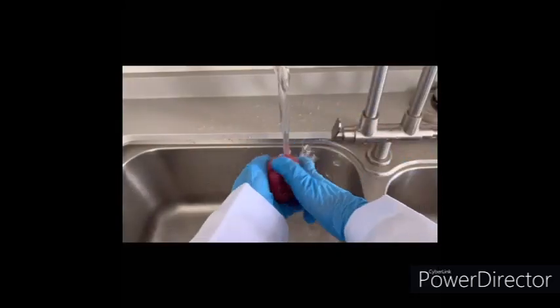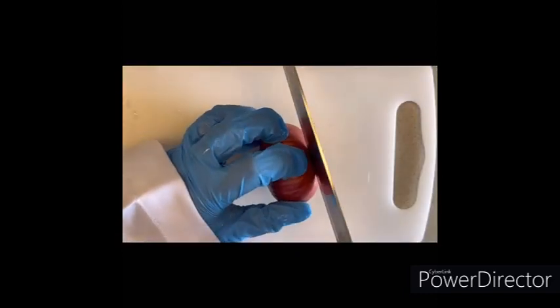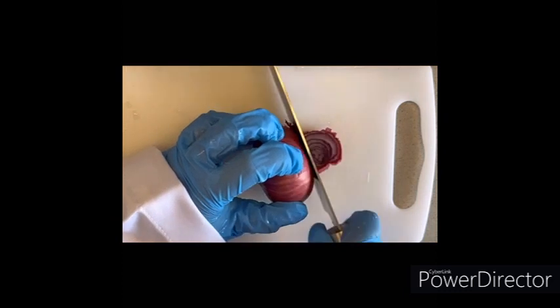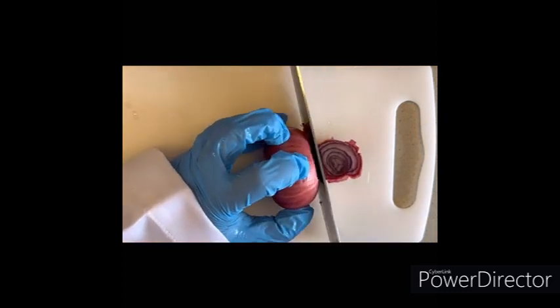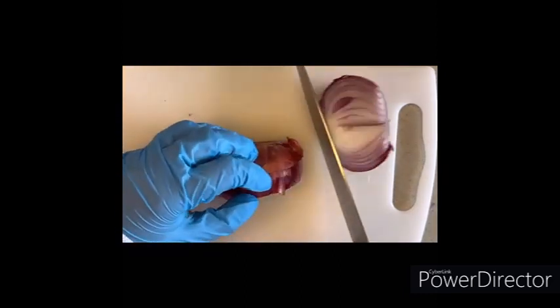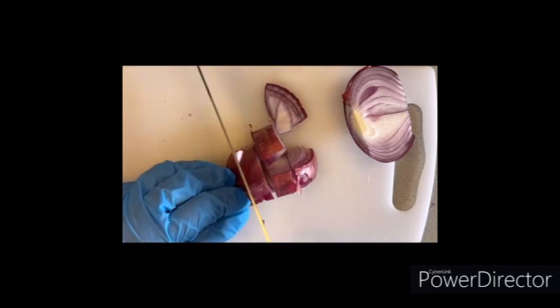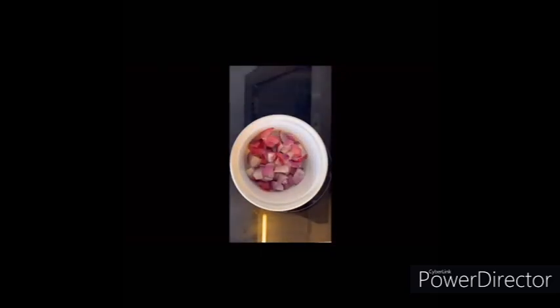Wash the onions to remove dirt and impurities. Then, using a clean cutting board and knife, cut the ends of the onions and discard them. Next, safely cut the onions into small pieces without removing the skin, as the skin contains the most anthocyanin. Place the cut onions into a glass container or preferably a beaker. Then add distilled water to the beaker or glass container until all the onions are submerged.